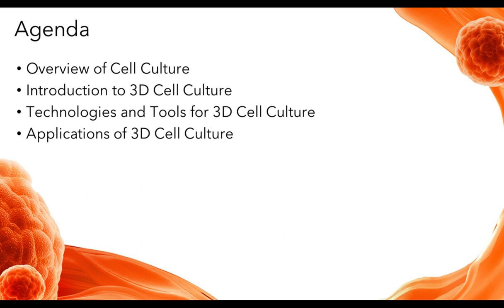The areas I plan to cover are to give everyone a broad overview of this area of cell culture and how it is applied to studying cells in 3 dimensions. We'll refer to this as 3D cell culture. I'll then give an overview of the various techniques and tools used in 3D culture, and then spend the majority of the talk subsequently talking about all of the various applications of 3D culture as well.